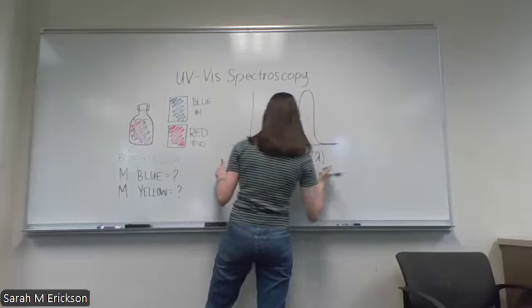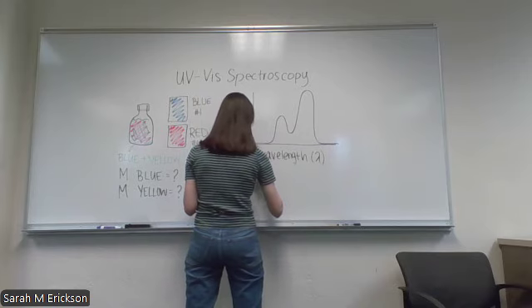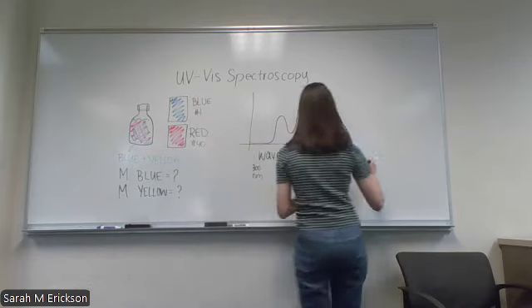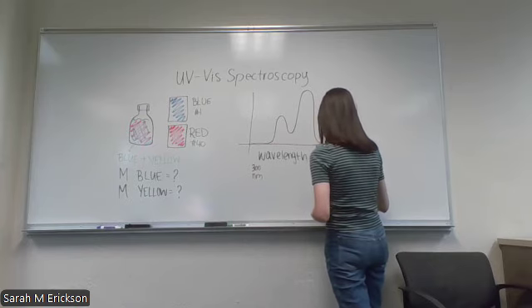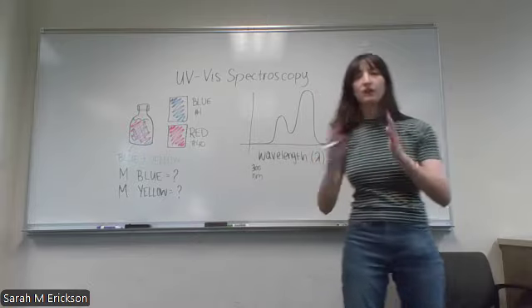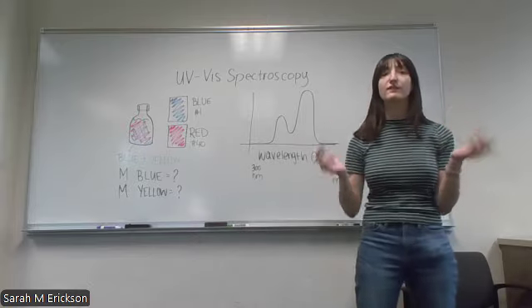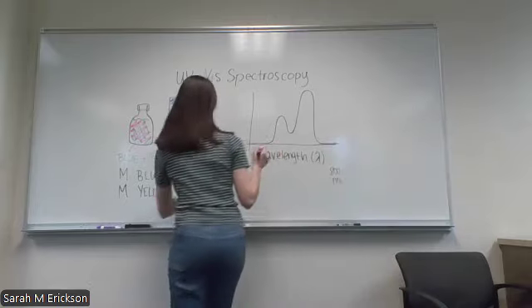That's lambda. And you're going to go from about 300 nanometers to about maybe 800 nanometers. And 300 to 800 nanometers is roughly the range on the electromagnetic spectrum of visible light. So red, orange, yellow, green, blue, indigo, violet. That's going to be 300, 800.